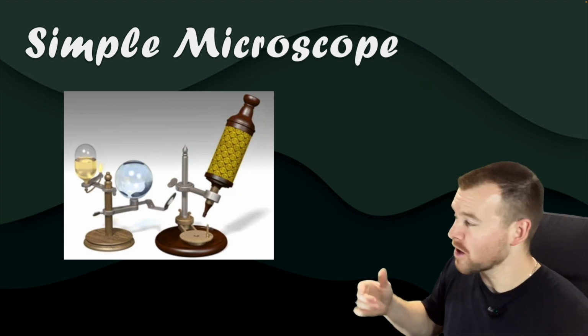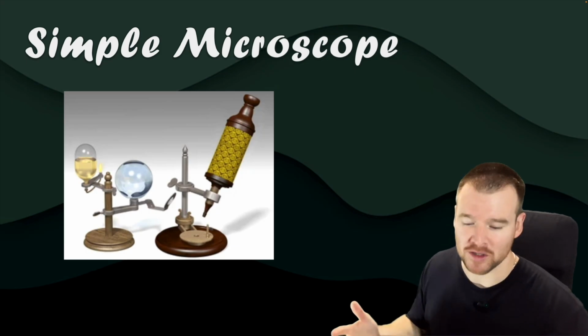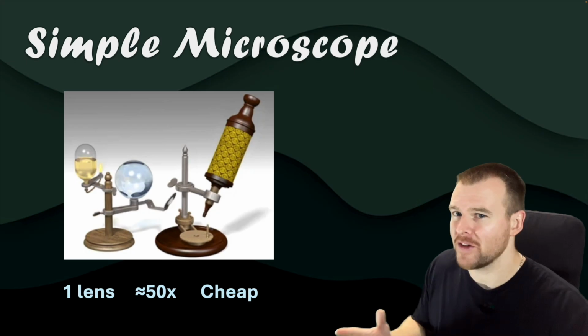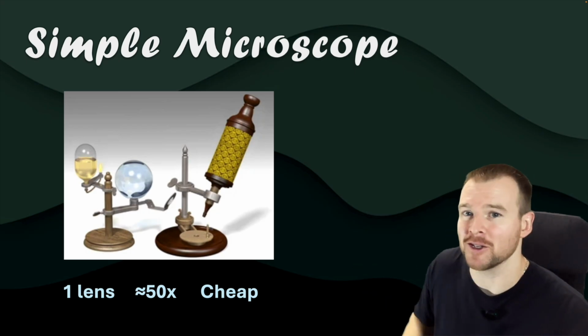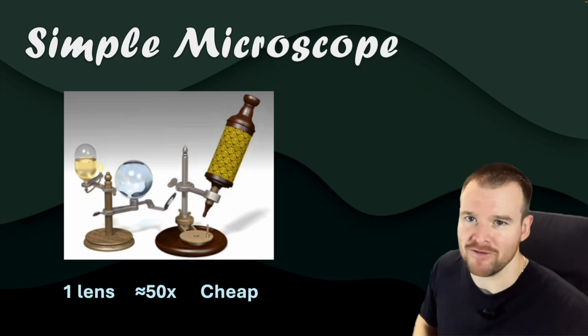And then they tried moving it to focus the image, but yeah, they just used that one lens that they were looking through. So fairly simple. Again, things to remember: one lens, about 50 times magnification, which for nowadays, that's not that good. Back in the day, it helped them to learn a lot of things. And again, because it's only one lens, this would be the cheapest of the microscopes.